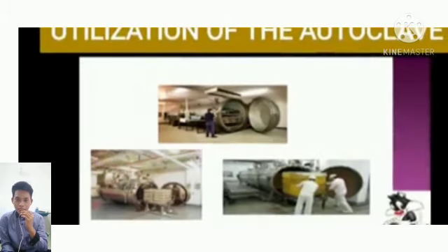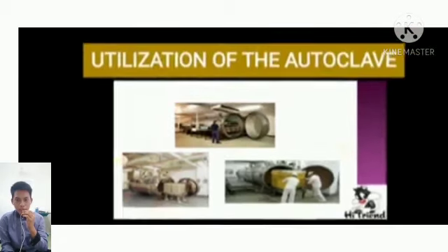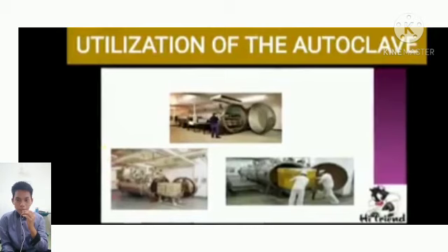Industry also uses autoclaves to sterilize materials to be used, where the use and method of working is almost the same, but the size is different.